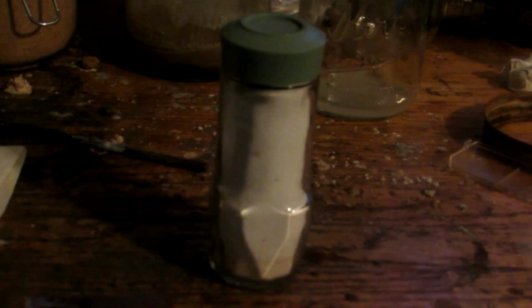Now, this is perhaps somewhere around a 50% yield. I can't actually be sure because I don't know how much silicon dioxide my sand actually contained, as there were certainly a lot of impurities in it. But nonetheless, you can see that it's actually quite very pure silicon dioxide here.